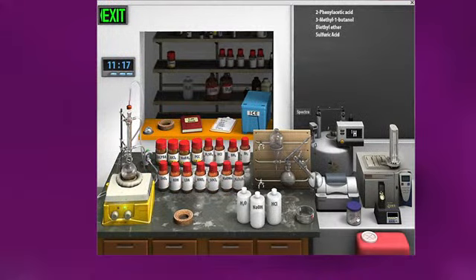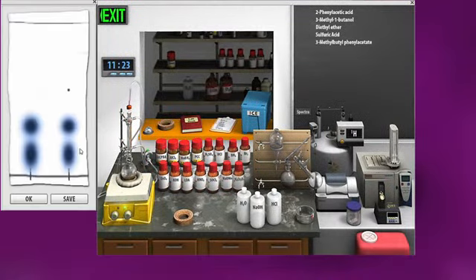We'll start watching the reaction to be able to track the progress. We can do a TLC. Okay, we can see we're right at the beginning. Here's our reagents track. Here's our products track. We can see we're just barely beginning to create those products because the reaction is slow.